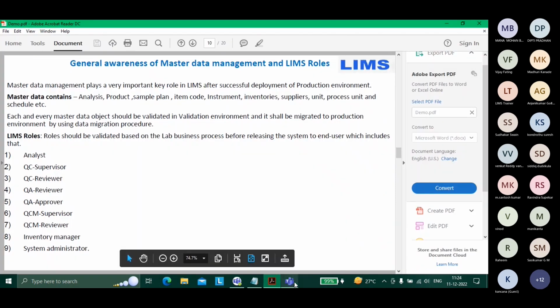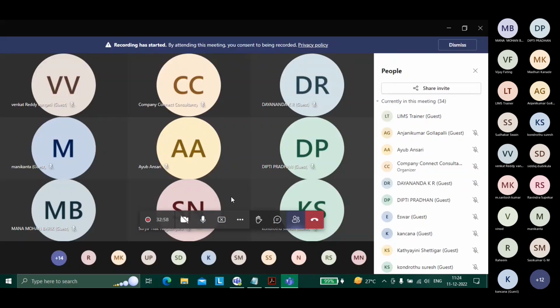Excuse me, sir. Actually, I want to know, are these modules created on the demand of clients? See, if I take the example of LabWare LIMS, there are a lot of templates. The template we mostly use in the pharma industry is the pharma template. For example, a client will go to LabWare and say, I have a pharma company, so LabWare will say, this is your pharma template. The pharma template has those modules which pharma companies mostly use.